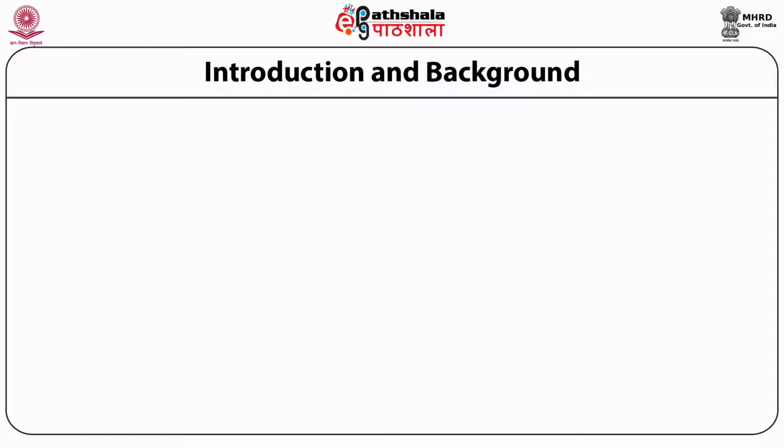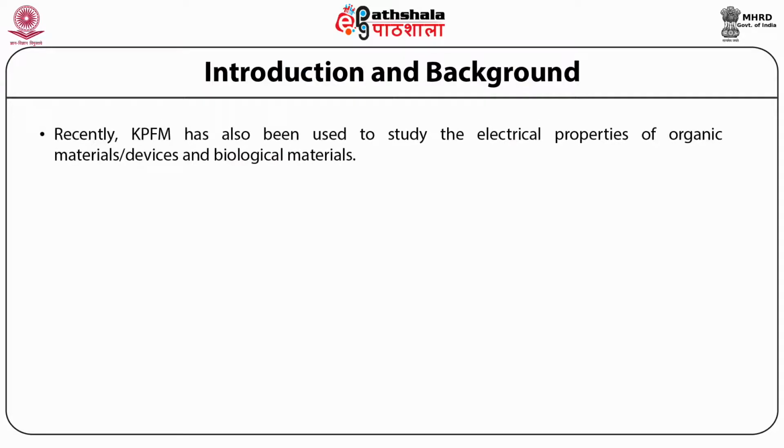Recently, Kelvin probe force microscopy has also been used to study the electrical properties of organic materials and devices, and has also been used for biological materials.